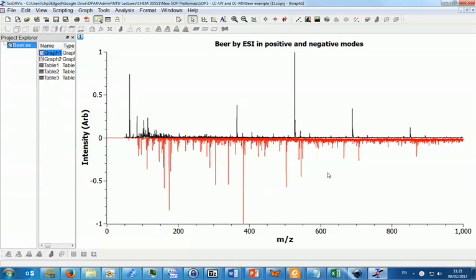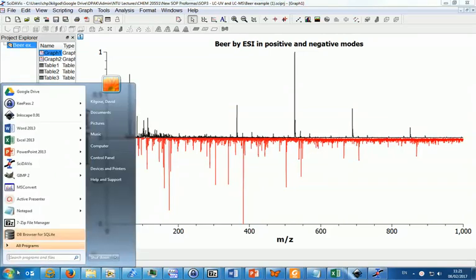So now we've saved the spectrum as an SVG file, we can open that up in a vector graphics program such as Inkscape, and there's instructions on how to download Inkscape onto your own computer in the notes. Open Inkscape.